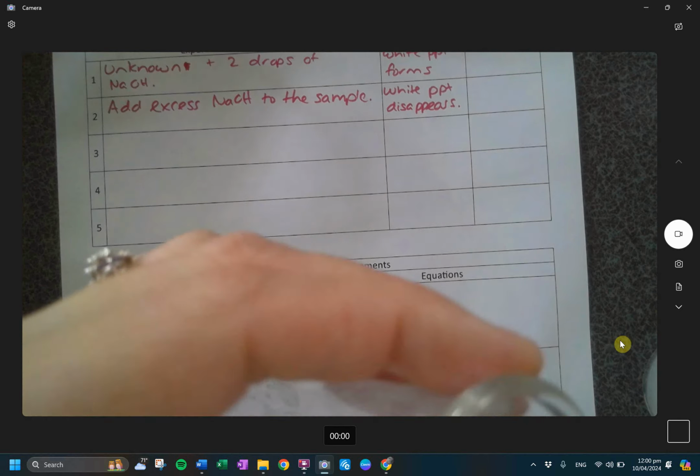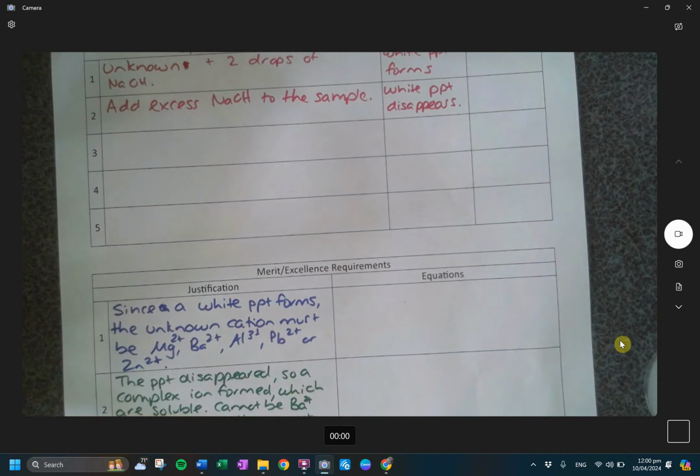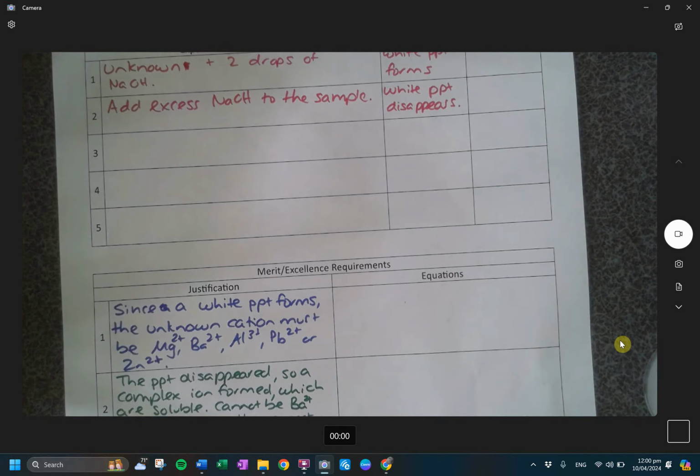When you do the lead with the ammonia, did I not? Why is it still not clean? Okay. All right. When you do the lead with the ammonia, you should get a white precipitate. Now, I've picked up a more concentrated ammonia just to make sure that it works. So we just do a little bit of a squirt.